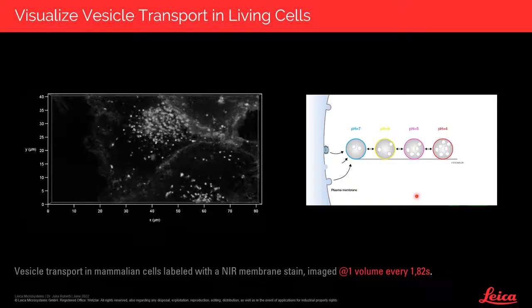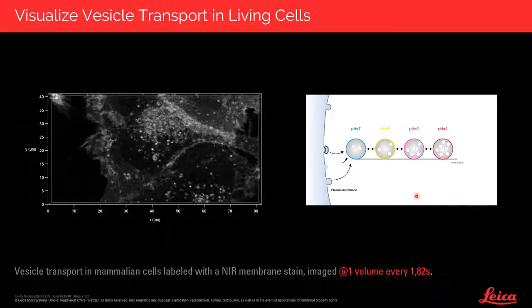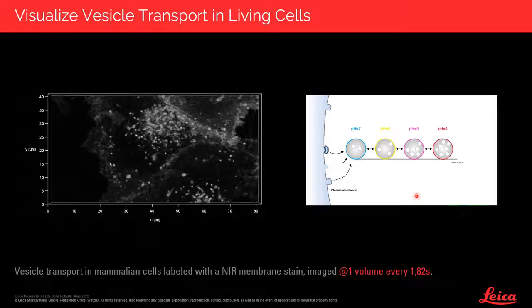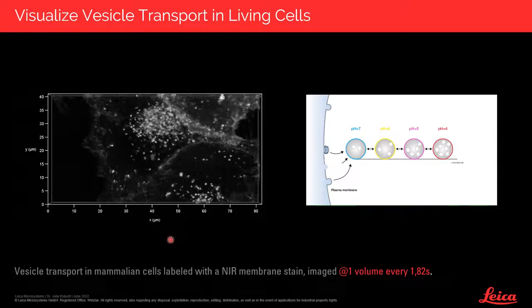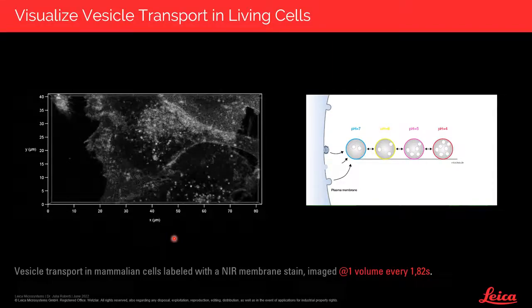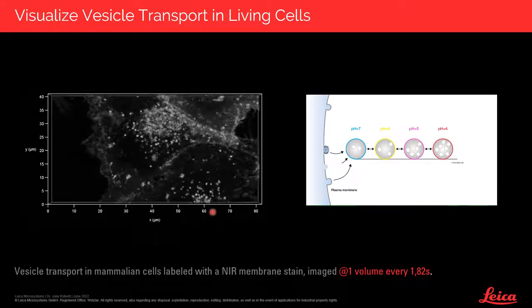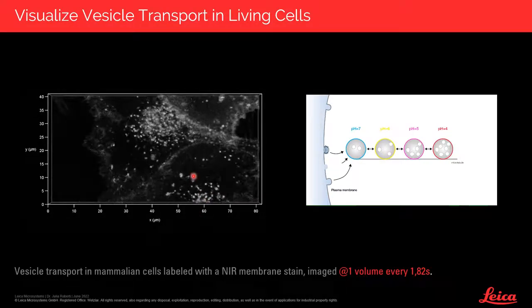So we need to find a way not only to visualize the vesicles, but also to get a readout of the pH changes. And now you can see that the limitation is not on the speed, but on the sensing, because if we just restrict our measurement to the photon counts that we detect, that is the intensity, we don't have a huge revelation of what is happening about the functional state of the vesicles, because the pH changes are not reflected here.